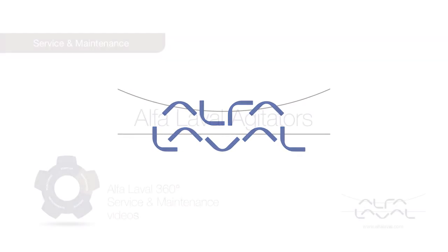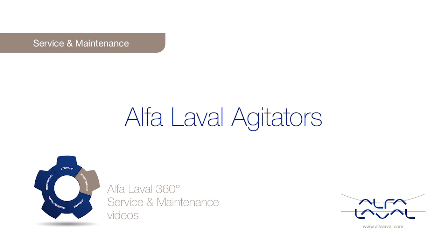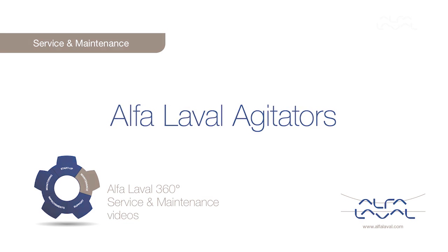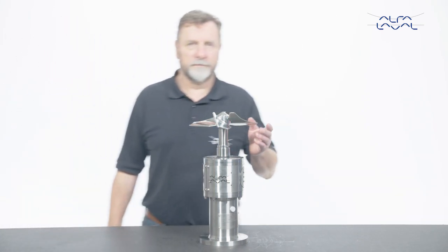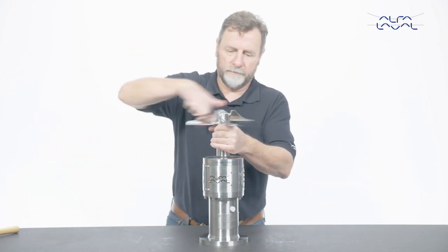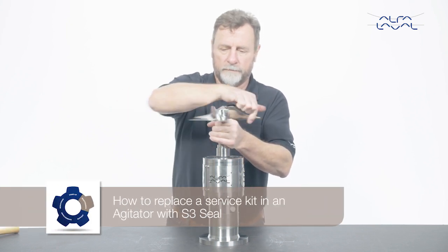Welcome to one of our Alfa Laval 360 degree service and maintenance videos. With Alfa Laval service you maximize the reliability and uptime of your equipment. In this video we will show you how to replace a service kit in an Alfa Laval agitator with S3 seal using genuine Alfa Laval spare parts. Whenever possible, demount the agitator from the tank before dismantling any parts.